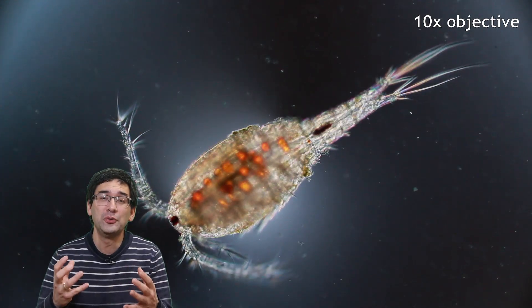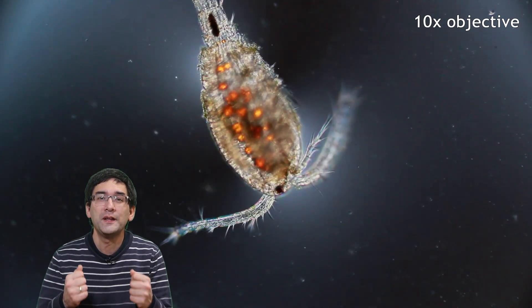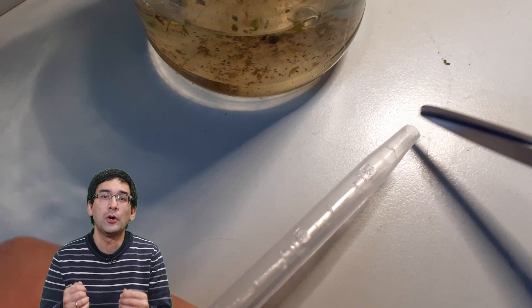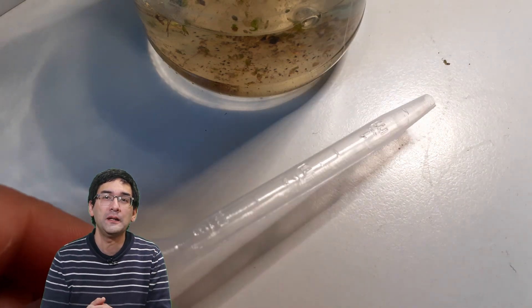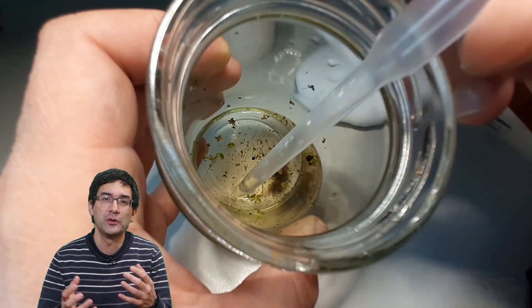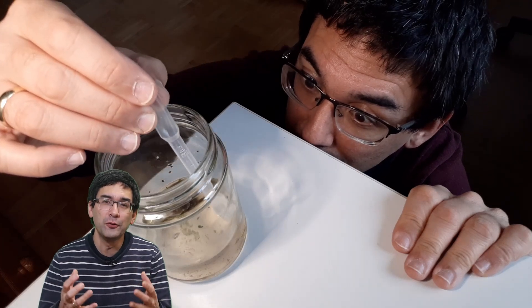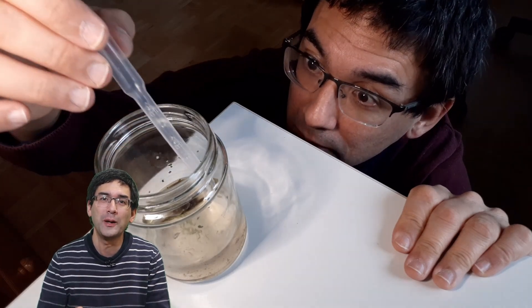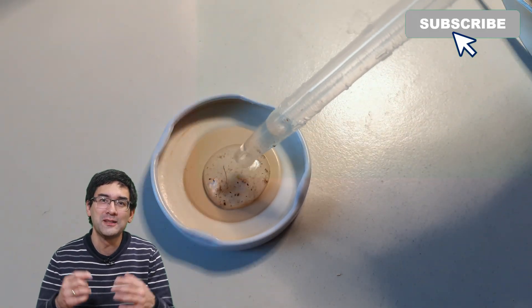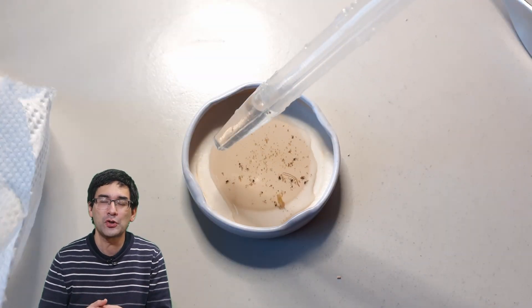What you need to do is take a plastic disposable pipette and cut off the tip. The larger opening allows more water to be taken up in a shorter amount of time and does less harm to the little critters. Still, it was quite difficult to catch them because they moved away so quickly, but with a little patience I was able to get a few of them into a small lid, and then retrieve some of them to place on a microscope slide.